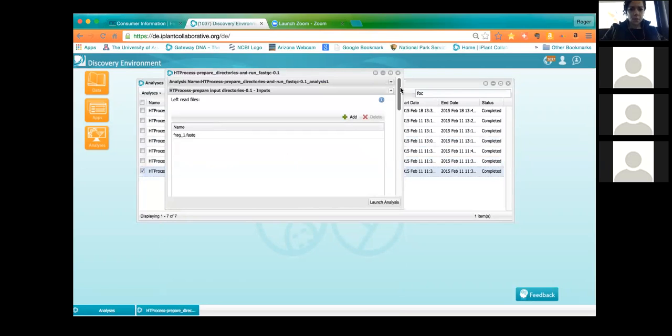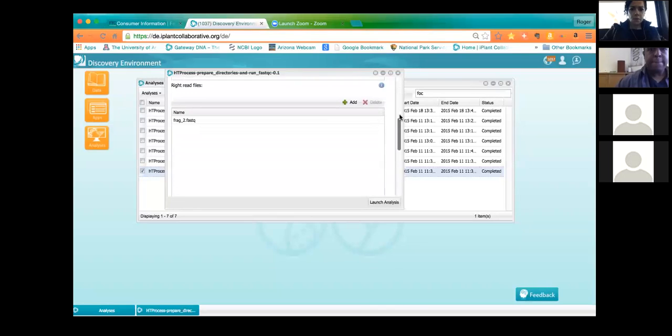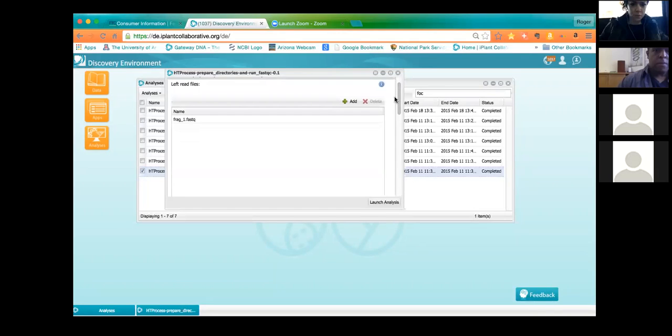Now, I wanted to just show you how it looks to enter data here. And here, for example, are the inputs. There's where the left read files go in. There's where the right read files, the unpaired reads. And so it assembles that information together. And the data used here is conveniently labeled frag for fragment and short jump for short jumping types of libraries. I guess in this step, we've separated those because they have different spacing, even though there are only 4 files for this whole data set.